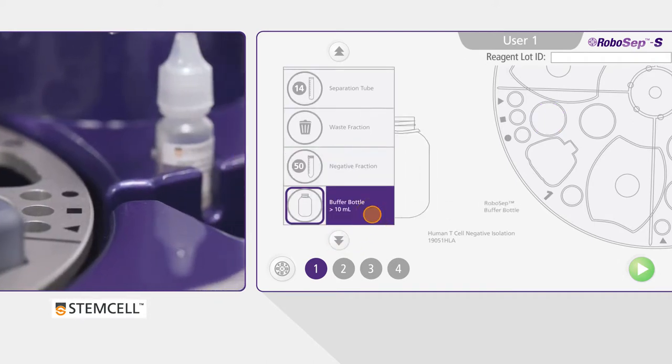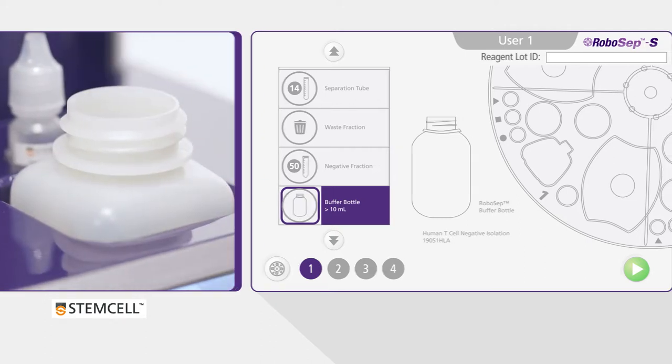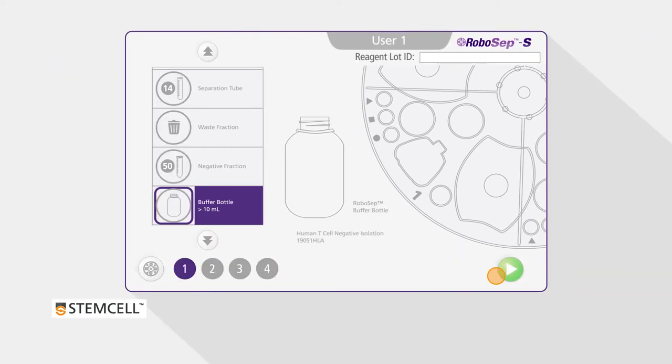Finally, ensure that the buffer bottle is in its corresponding compartment and uncap it. When a quadrant is completely loaded, press the green button on the lower right corner of the screen.